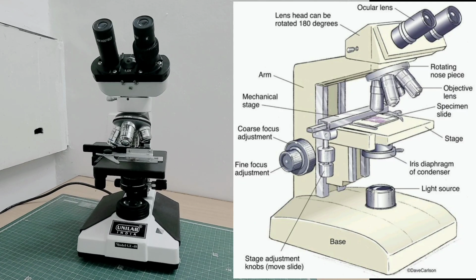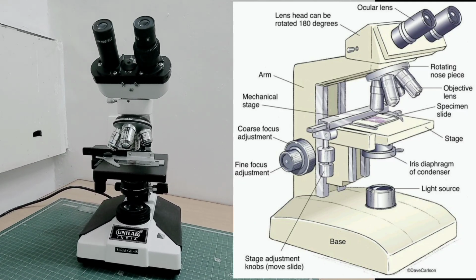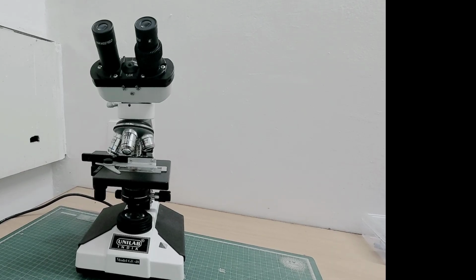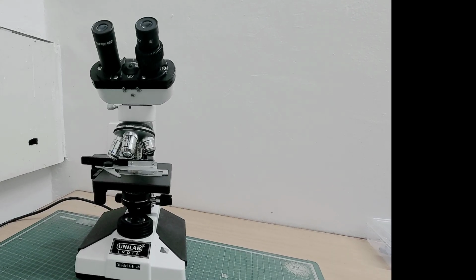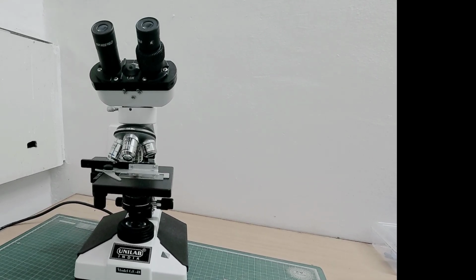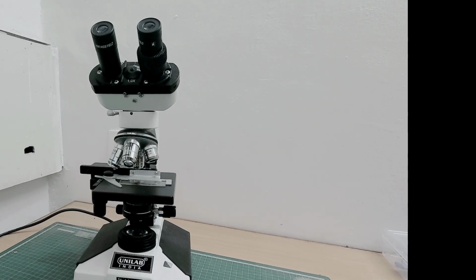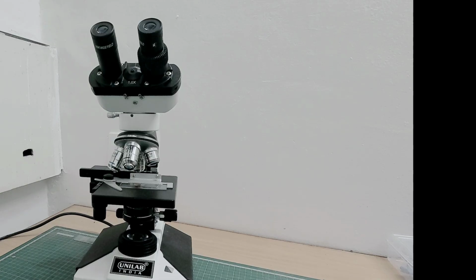Study the compound light microscope in detail, not just the parts, but also the working principle, magnification, resolution, and the scientific reasoning behind oil immersion. This explanation is suitable for class 12 or BSc students and anyone who wants a deeper understanding of microscopy.